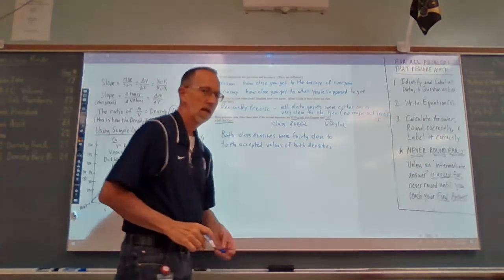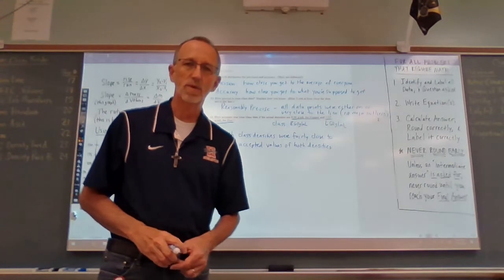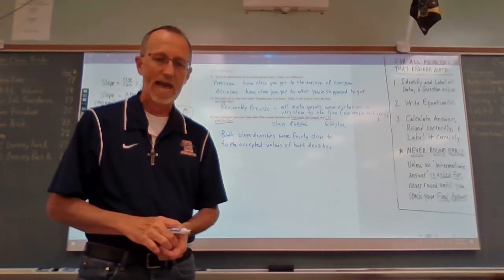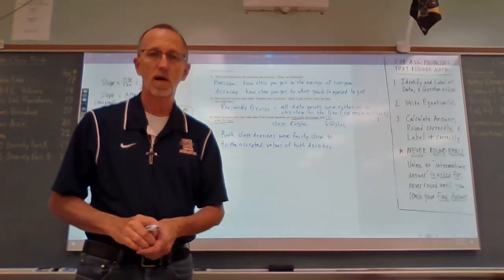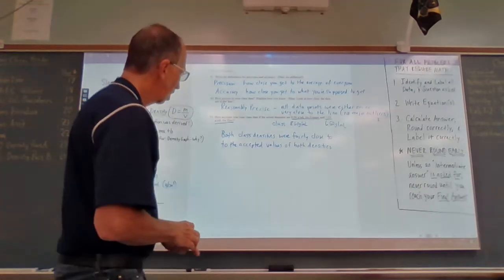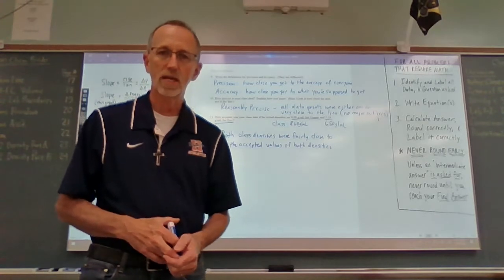So here again, not only was the data precise in that it was very close to each other, but the data was also accurate in being close to what the true values actually are. So this worked out pretty well. The data was both precise and accurate, so that's good. All right, that takes care of part A. Hope everybody understands what we were trying to accomplish here.